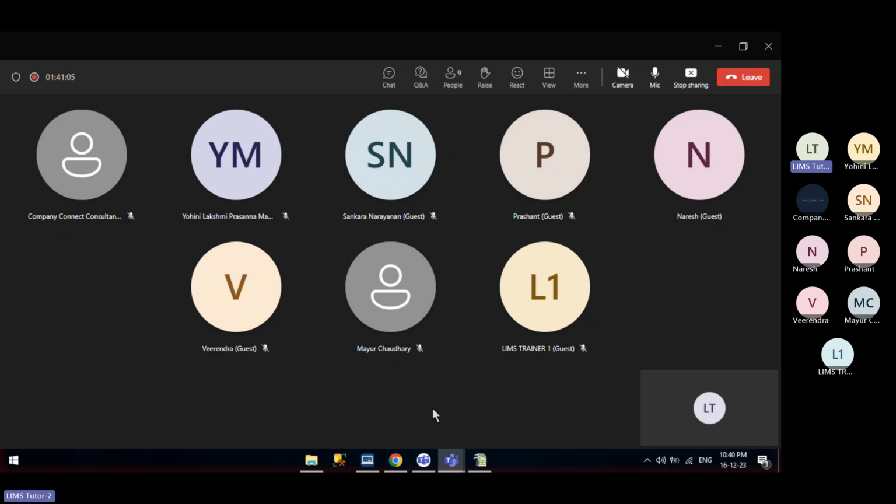You have your quality background. So use that as an advantage if you already choose a path from the LIMS functional or business administration point of view. When we say business administration, it is functional: business analyst, business functional manager.